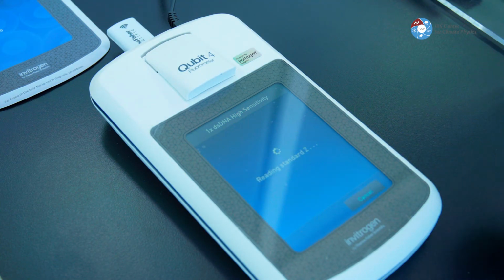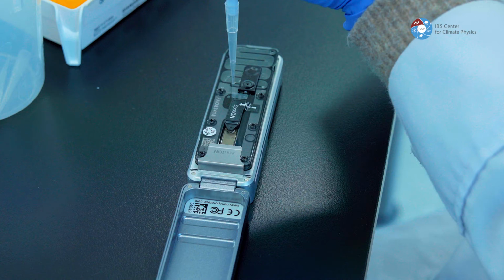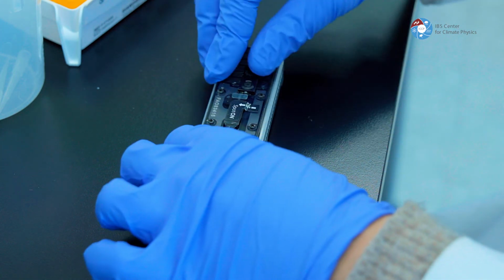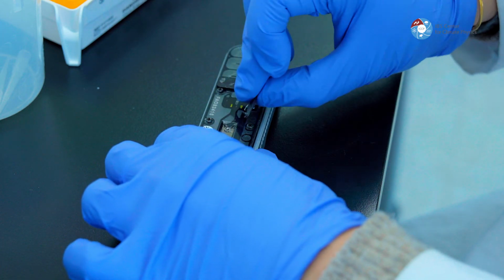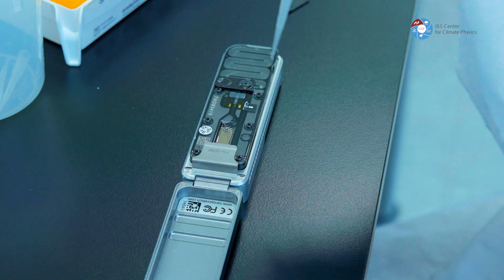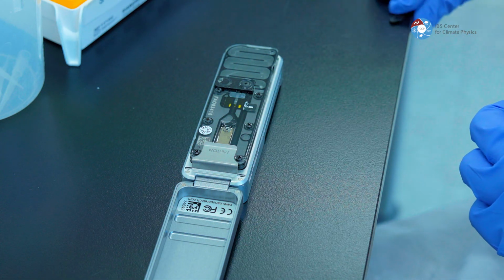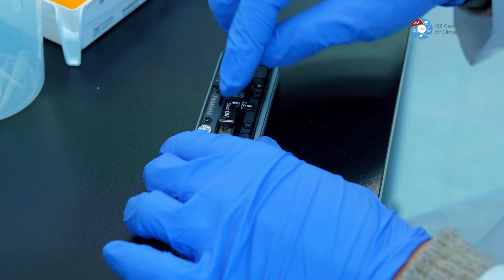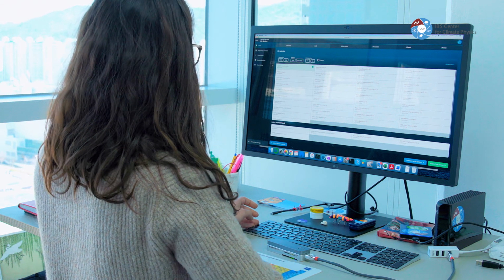The MinION is a relatively new sequencing technology, which is extremely portable and versatile. The initial DNA soup from the sample is drawn through an electrically charged membrane, which consists of thousands of nanoscale pores which bind to the DNA fragments. DNA strands are then sucked through the electrically charged nanopores. Every DNA letter, C, G, T, A, creates a slightly different electric current, which is measured and transferred through a USB port to the computer. Eventually, the sequence of electric signals can be translated back to our DNA code. The resulting data can then be used for taxonomical identification, quantification, and other bioinformatics analysis.